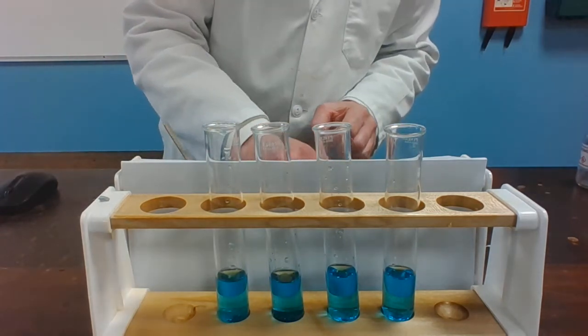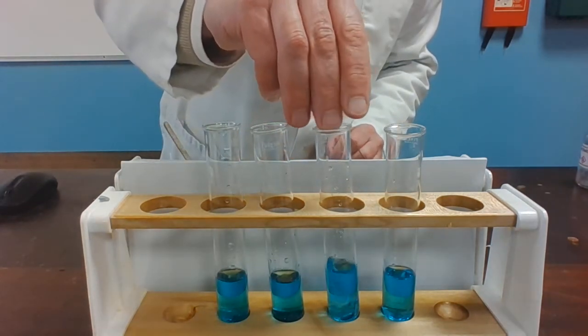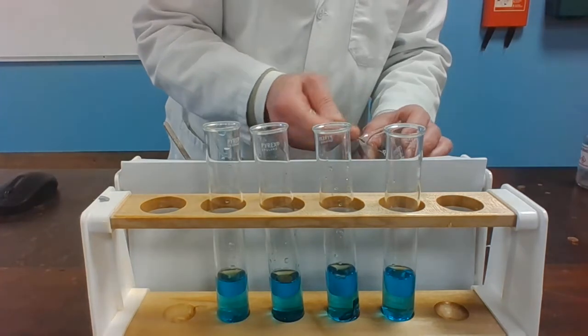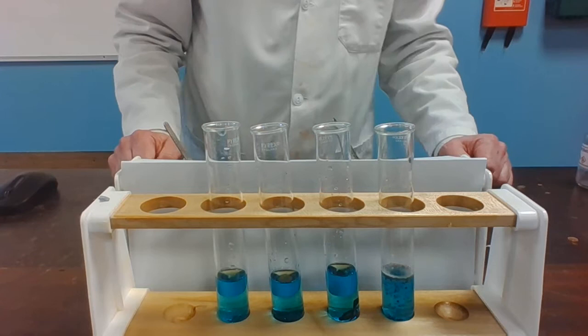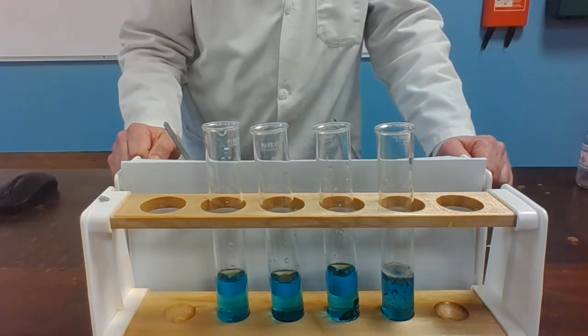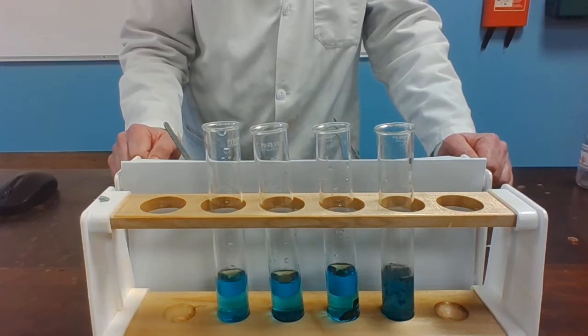Into the third tube some zinc granules. And into the final tube some magnesium turnings. Ignore any side reaction that you can see there with the magnesium — we're looking to see if there is any evidence that copper is being displaced.